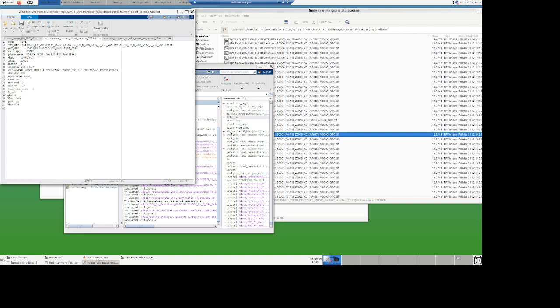I'm telling the system that this is a 3-dimensional problem, so it's going to really look for a 3D stack for the foci. That's my filter for the sphericity of my nuclei. So anything above 1.5 is eliminated, and that's the pixel size, which is probably wrong, but that's okay. Just like I told you before, the nuclear area computed for the nucleus, just take it as a relative value. Don't take it as an absolute micrometer square value, because it's not.